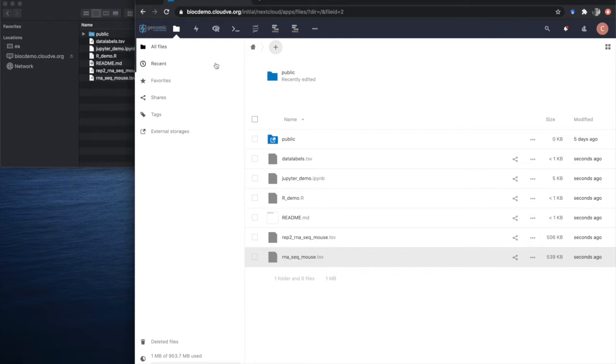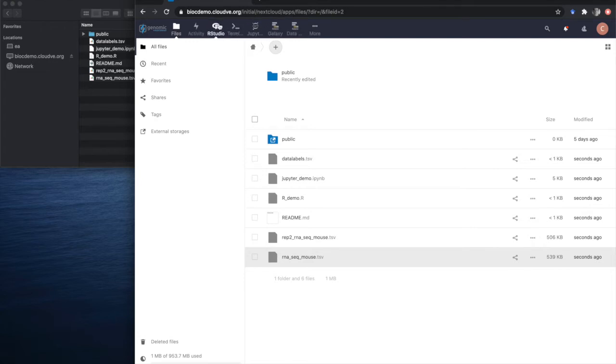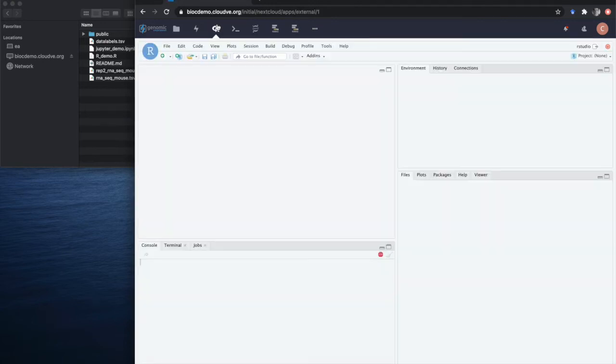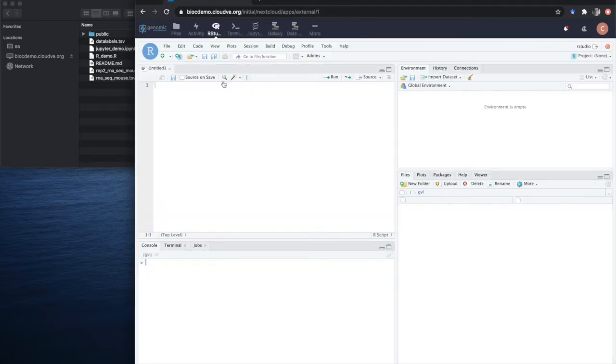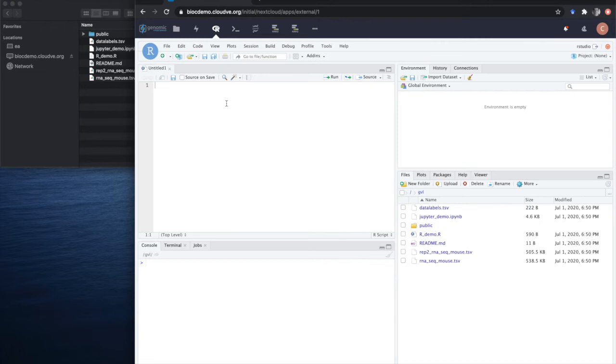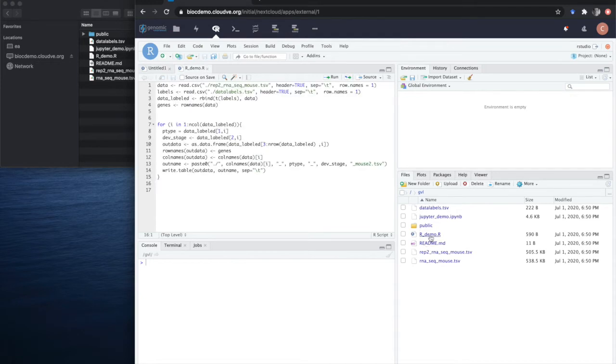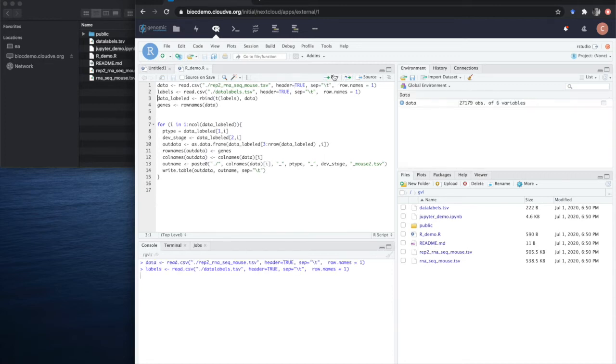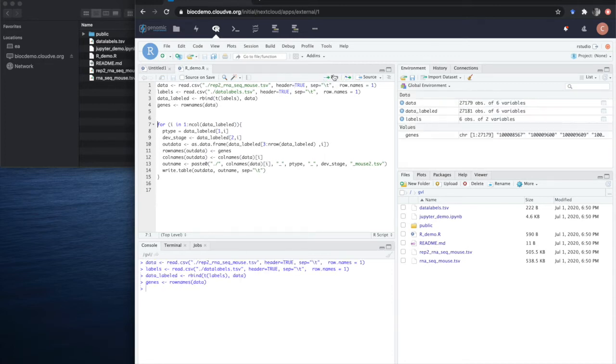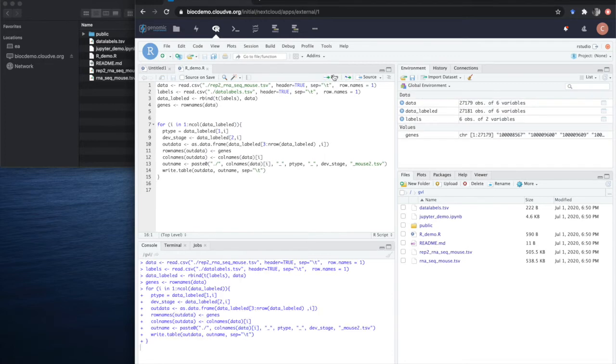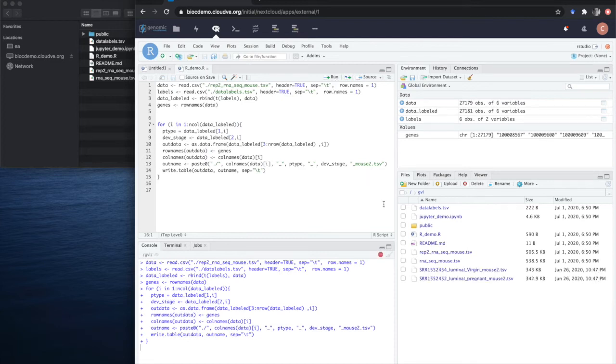Once uploaded, this data is available to all the applications that are available in the GVL. For example, if we look at RStudio, we have our own instance of RStudio available for analysis, and the data that we uploaded into the data browser is instantly available. We can load one of the R scripts that was uploaded there into RStudio, run through the script to execute the commands, and as the script runs, the datasets are produced.